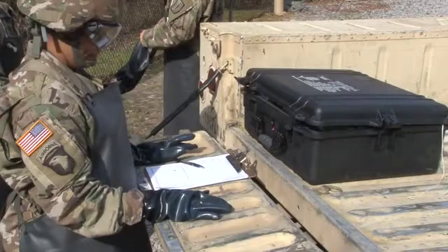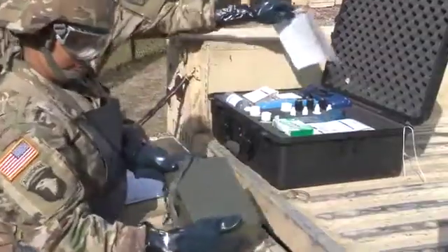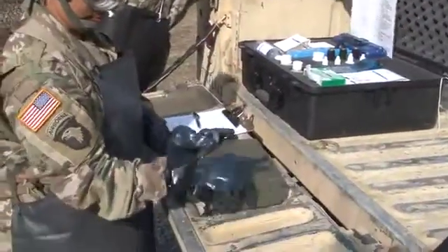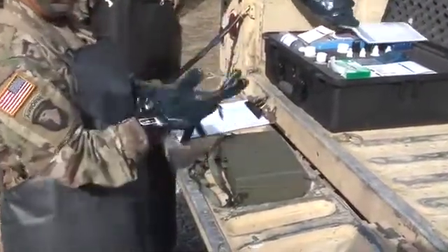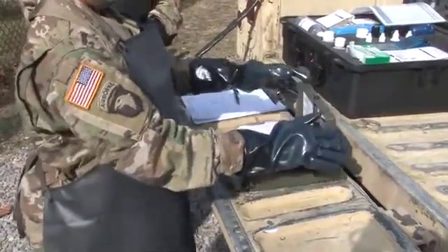The M272 is a portable, lightweight kit that will detect and identify harmful amounts of CW agents when present in raw or treated water. With this kit, you can detect cyanide, mustard, lewisite, and nerve agents when present in water in dangerous amounts.